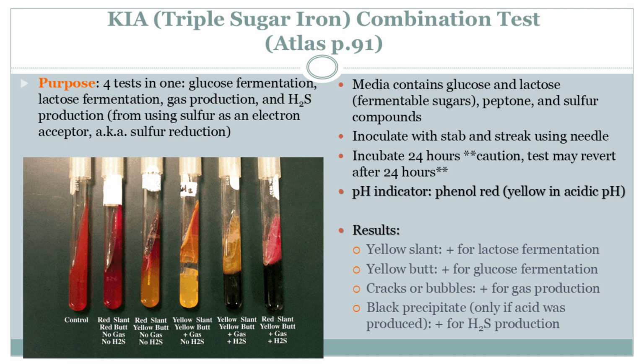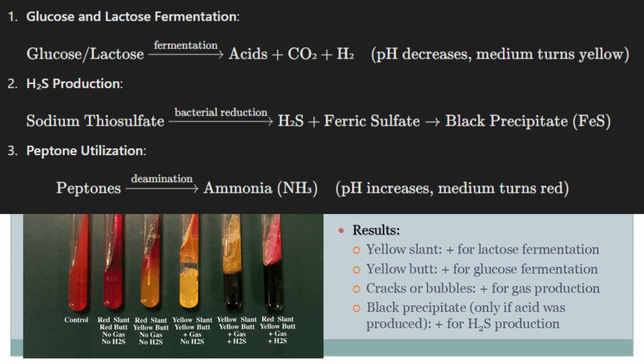Like what? So, for example, it can be used in environmental monitoring. If you're trying to understand the microbial diversity of a particular environment, like a soil sample or water sample, you can use this test to get a sense of what kinds of bacteria are present. Oh, interesting. So we're getting a snapshot of the microbial community. Exactly. And that can be useful for a variety of reasons. Like what? So for example, if you're studying climate change, you might want to know how changes in temperature or precipitation are affecting microbial communities in different parts of the world.